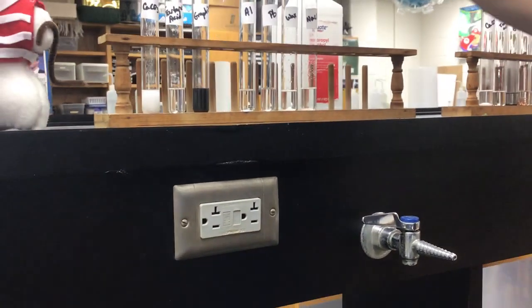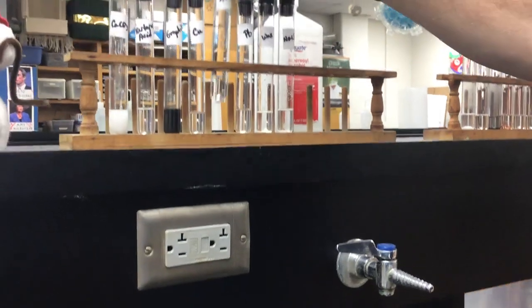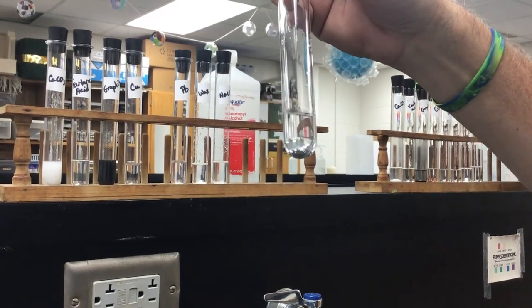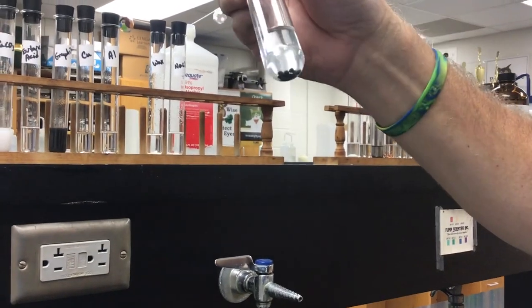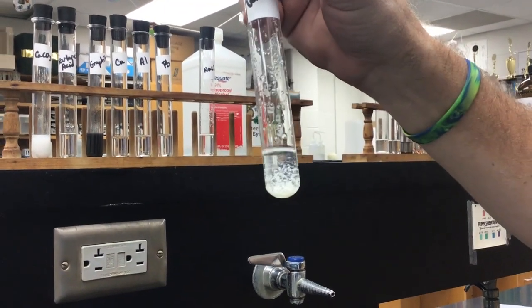The copper, I think I can still see copper sitting down there in the bottom. Probably similar with the aluminum and the lead. If you look down the bottom for the aluminum, there's still a bunch of aluminum in there. Here's your lead shot. Down there on the bottom. Here is the wax. Still see some of that wax in there too.